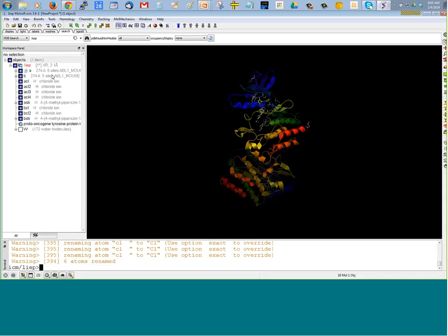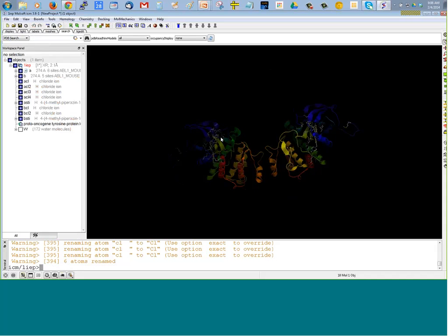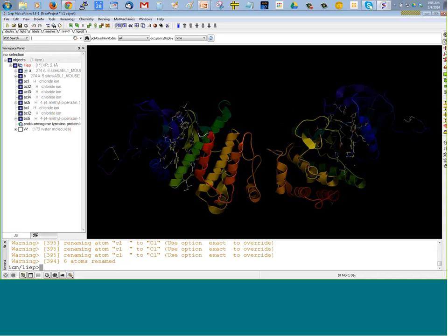Okay, you can also search by a string, so you could type kinase, for example, and you can also search Uniprot, Pocketome database, and other databases here, which will bring in that information. So we've loaded in a kinase structure, and we can see it's loaded in the 3D window here, and also in the ICM Workspace.